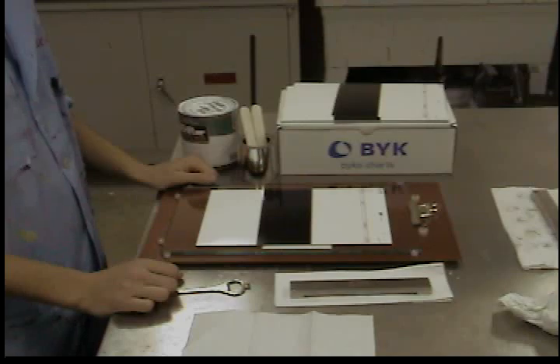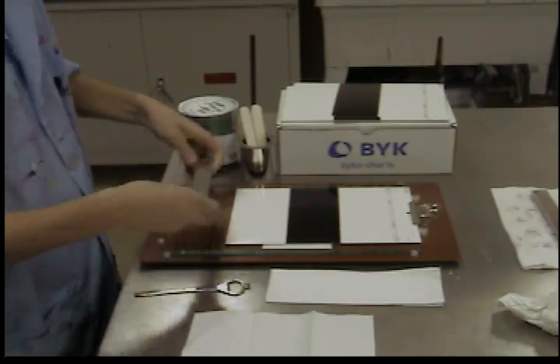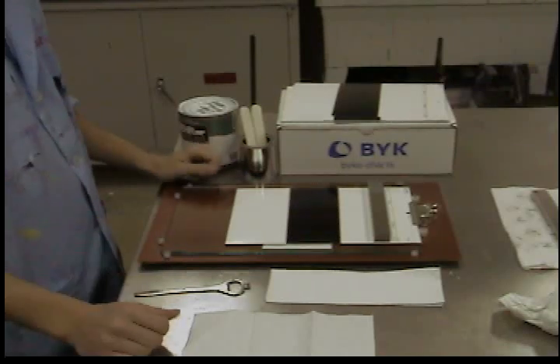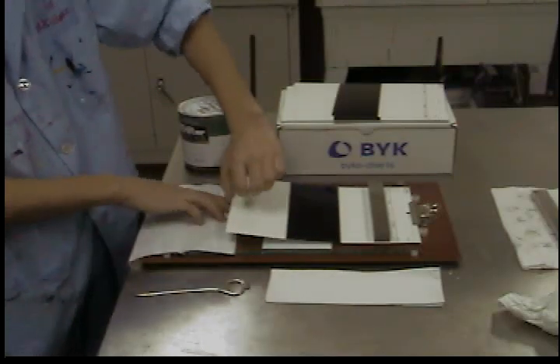Secure the Bicco chart to the drawdown plate. Place the applicator at the top of the chart, just below your labels. The larger side of the wedge on the bottom should face towards you. Place an unfolded paper towel under the end of the chart to catch the excess paint that will be pulled beyond the end of the chart during the application process.